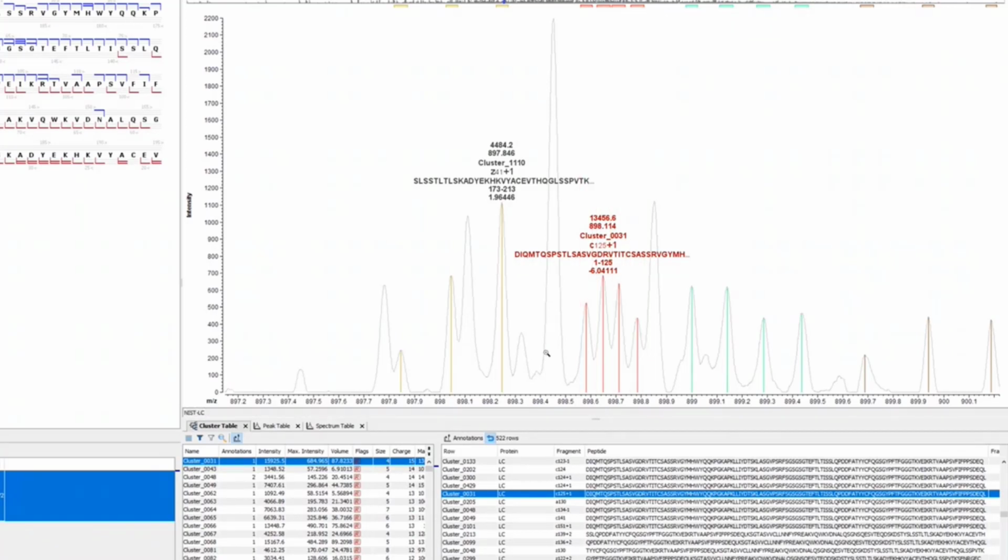And you can see there's a lot of adjacent pieces of evidence, right? It's in amongst other ions. And what the interface and the technology is trying to do is piece apart and associate the right peaks with the right isotopic clusters. And so it's working very hard to do this for us.